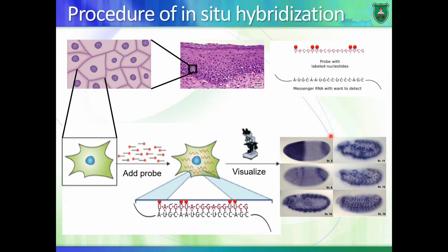This is the embryo of Drosophila, the fruit fly. You see that there's a lot of signal coming from this region when we probe for a certain gene, and little expression coming from this end of the Drosophila. Look at this expression right here. You see it in the perimeter of the embryo, and you see some expression right here.